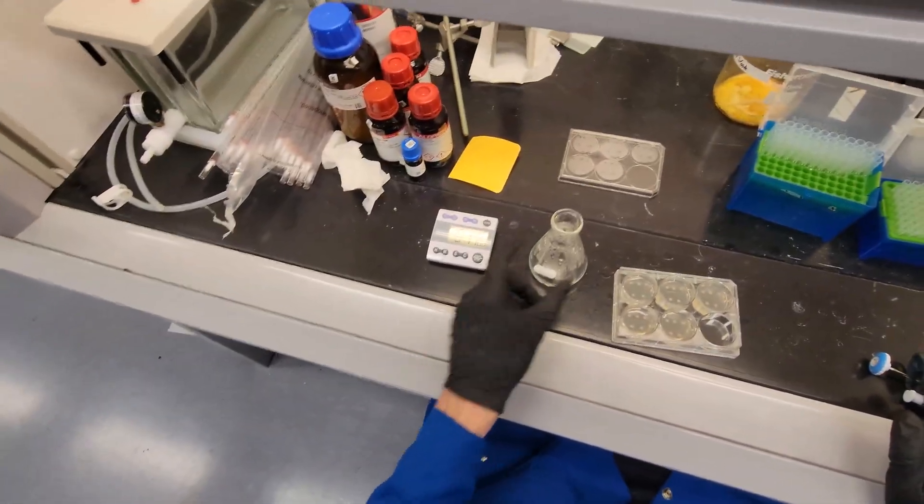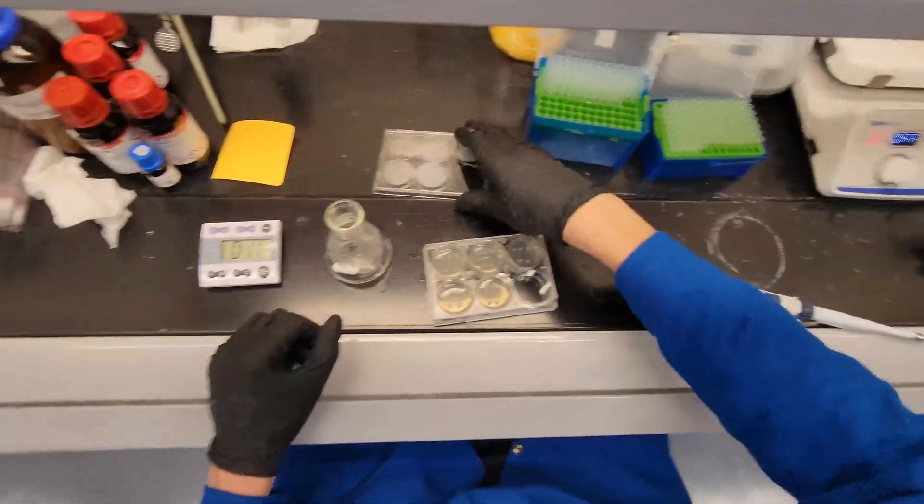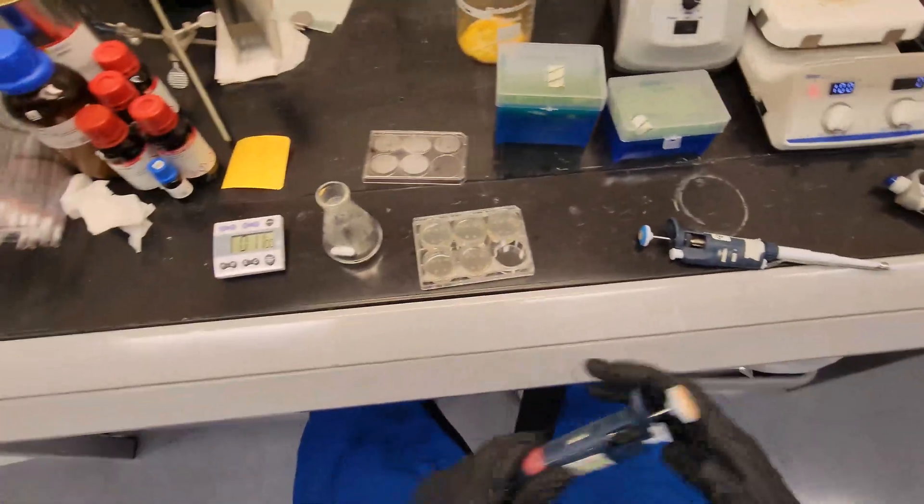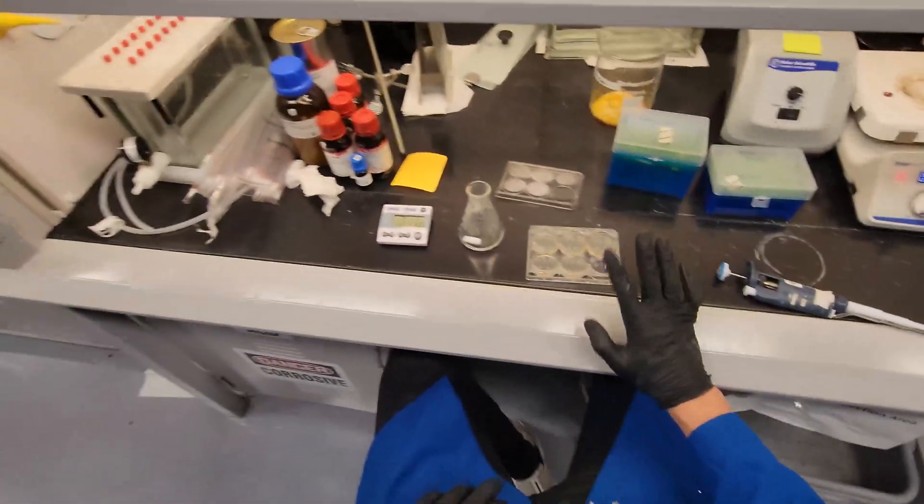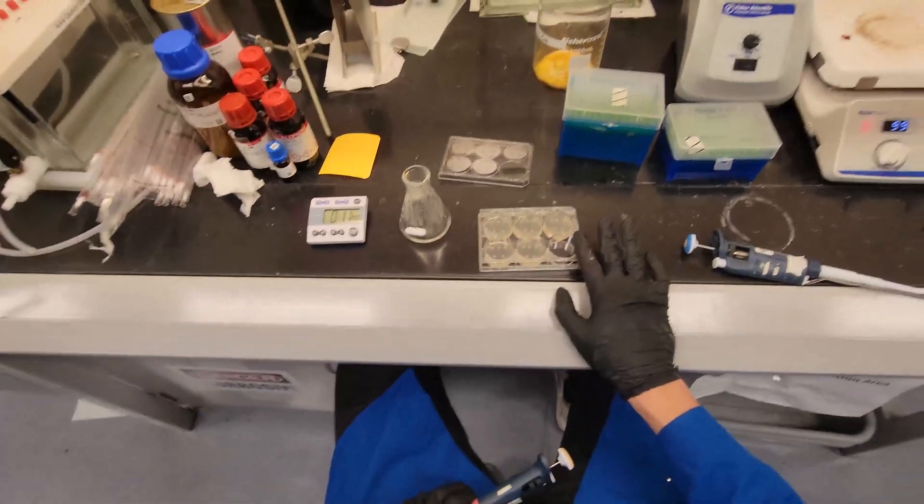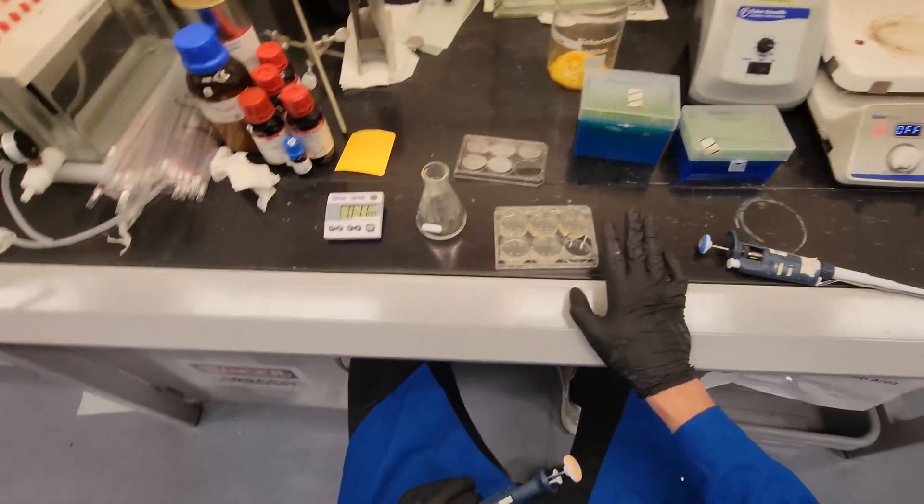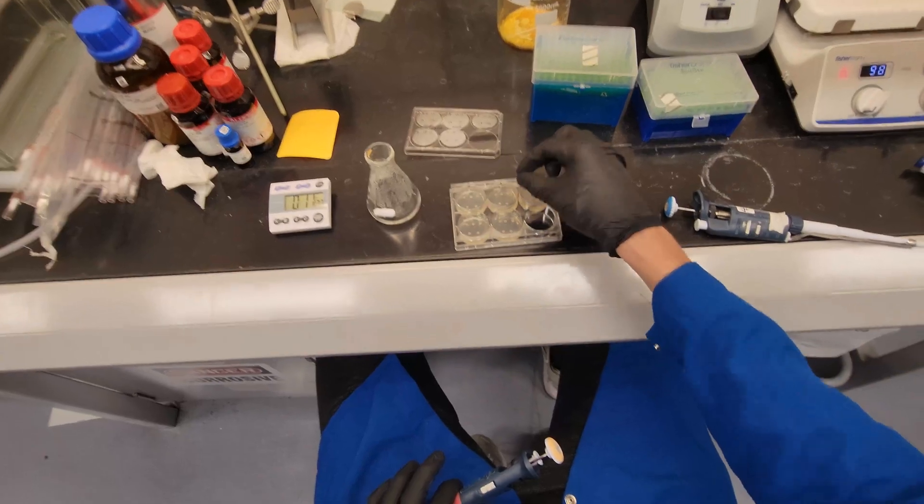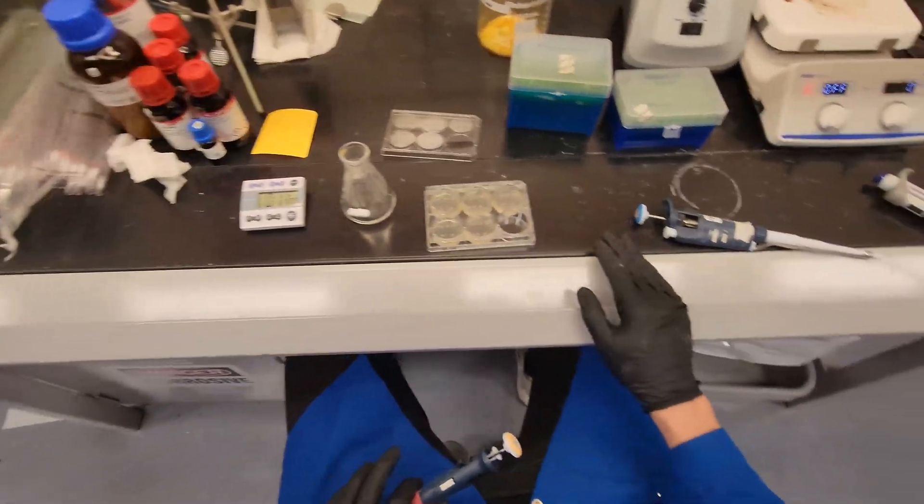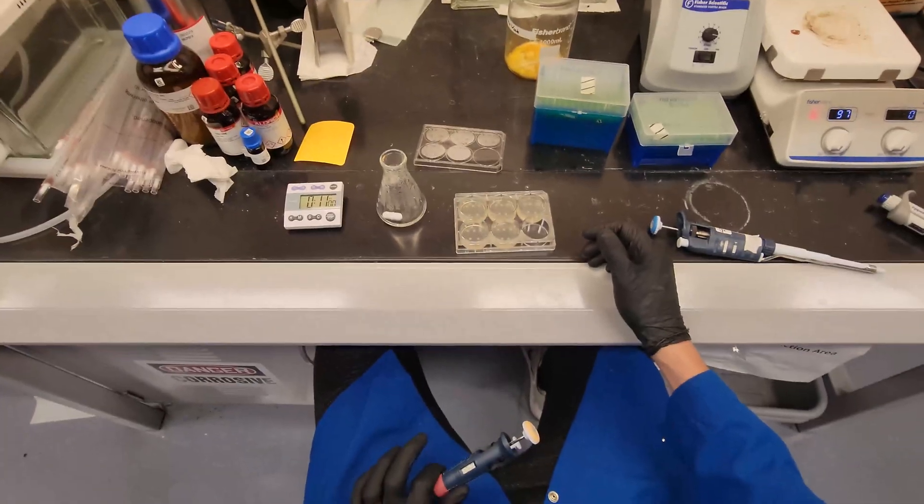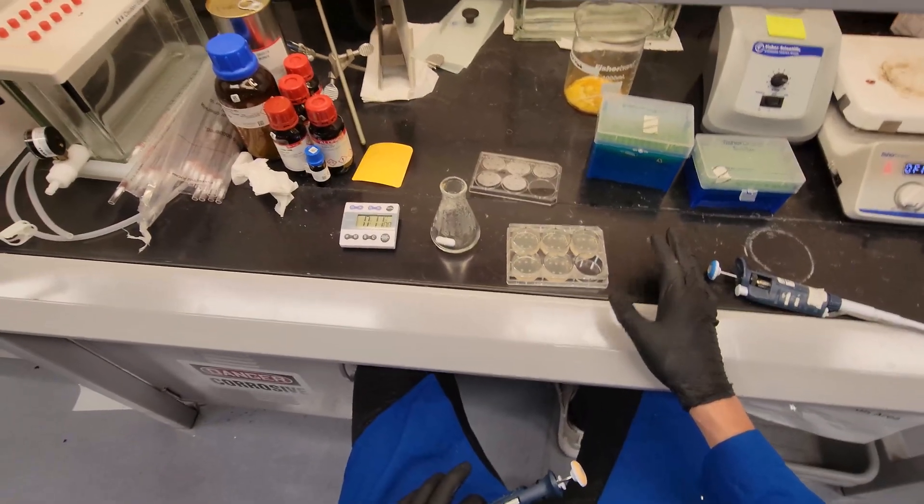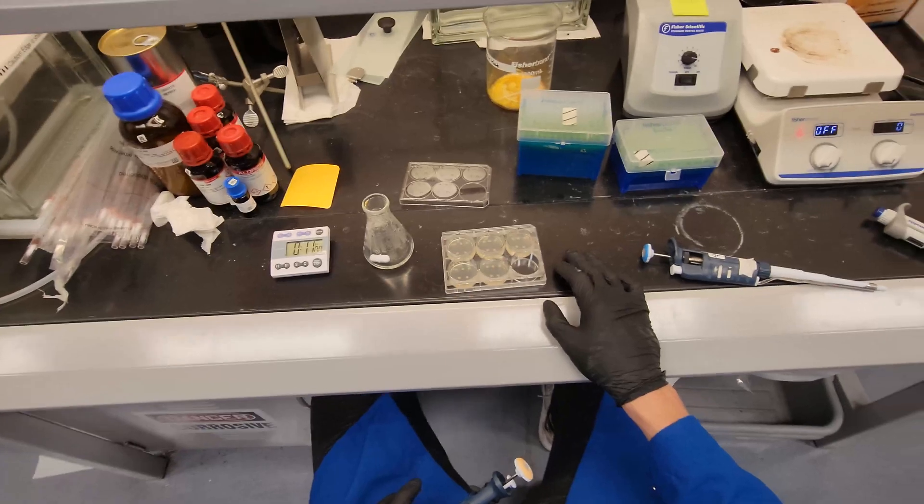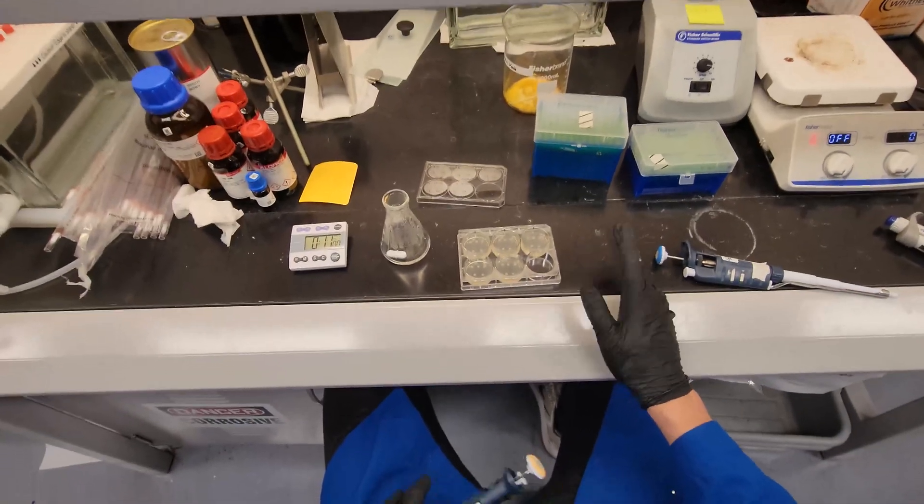So this needs to be disposed of properly in biohazard. I'm going to let this cool. Let's see. What else do I need to put away? These need to be put away. But you'll just incubate this. The original protocol says to incubate at 37 Celsius for 24 hours. But I found with certain staining conditions, the colonies will bleed into the agarose and the stains won't look very good. So you can leave this at room temperature for 24 hours and it will stain fine. And you can store these plates in the fridge after they stain for months, really. And the stain gets a deeper blue if that's something that you need.